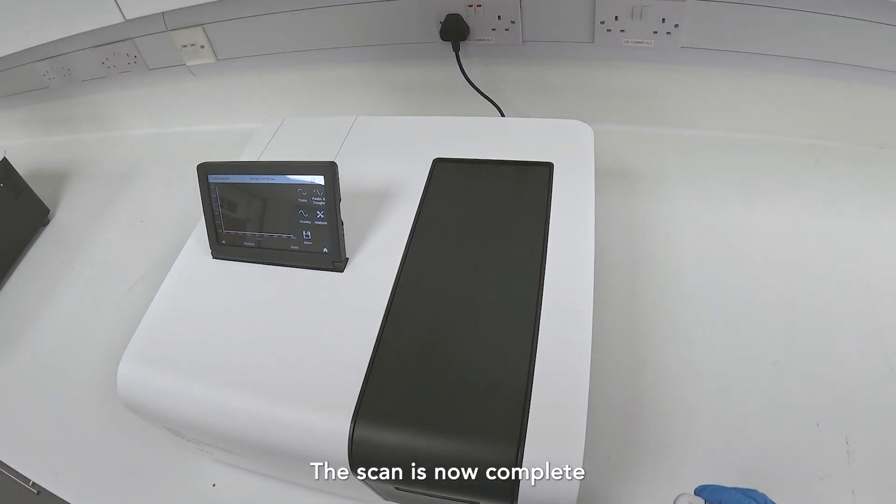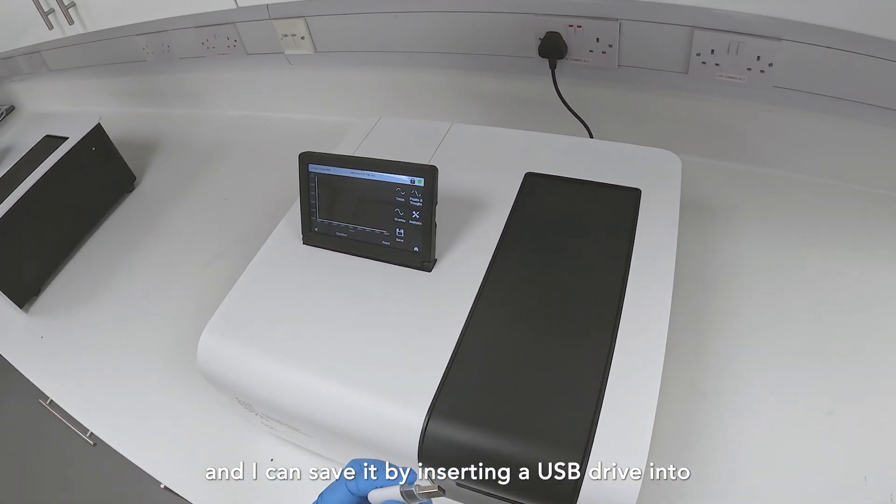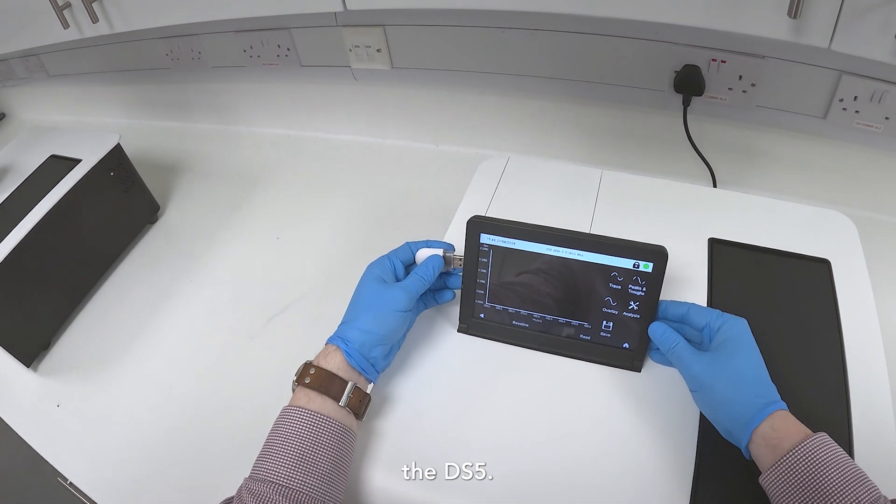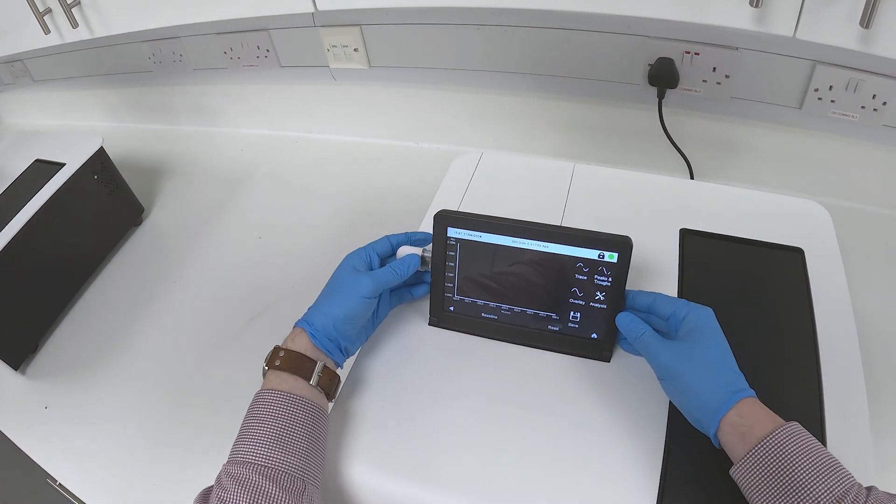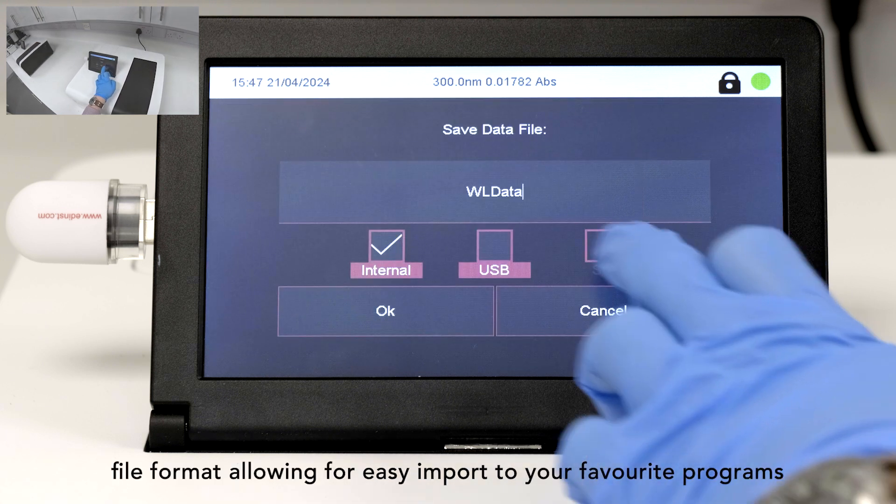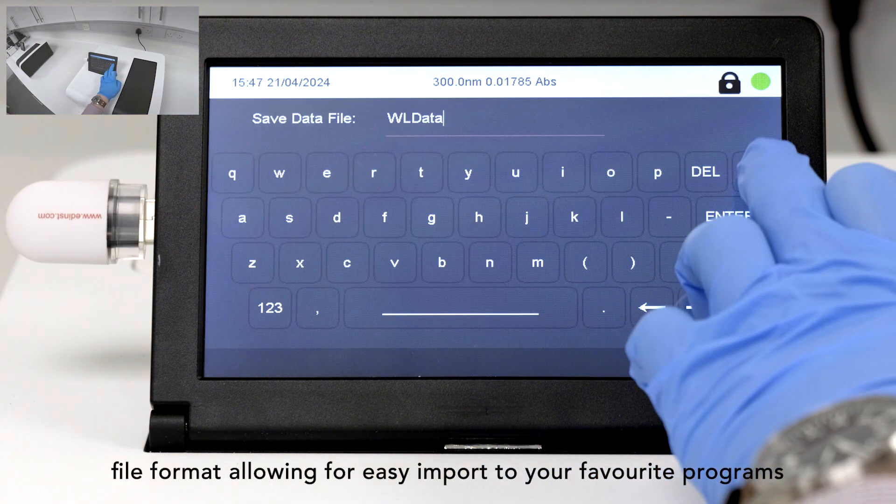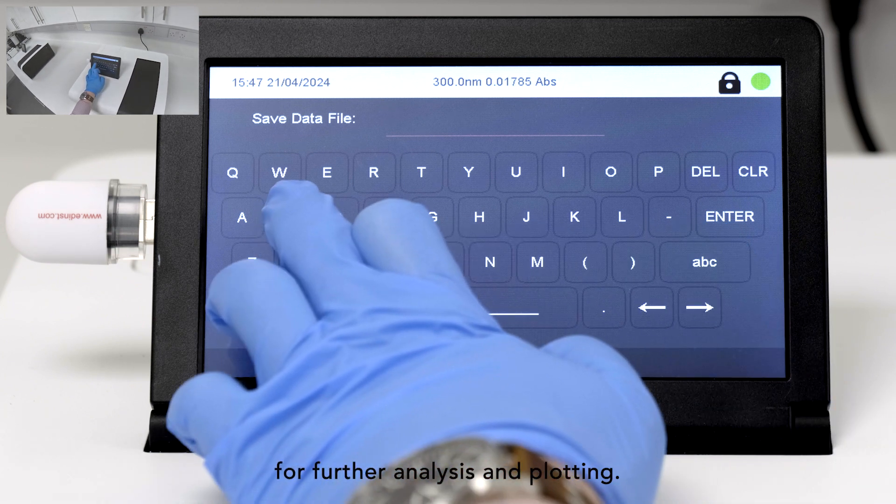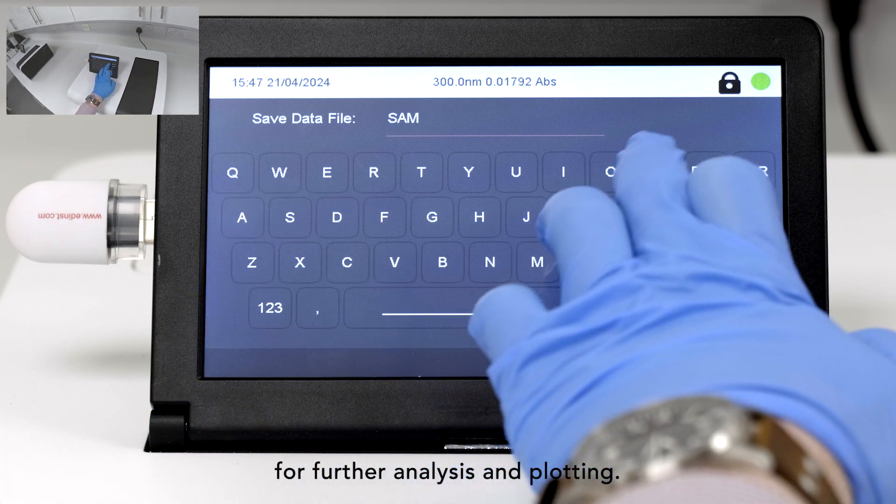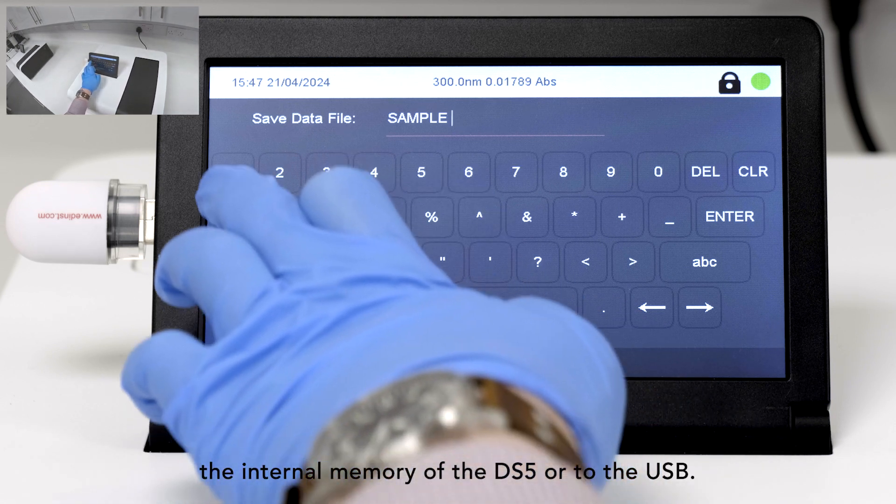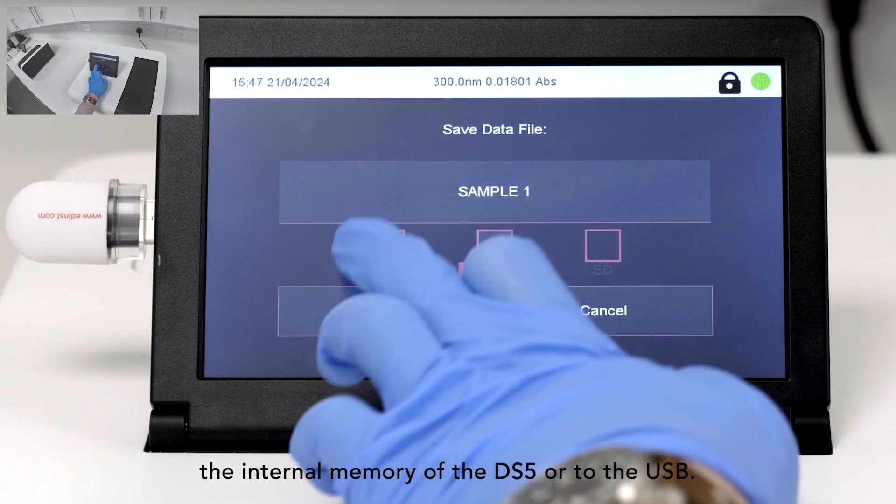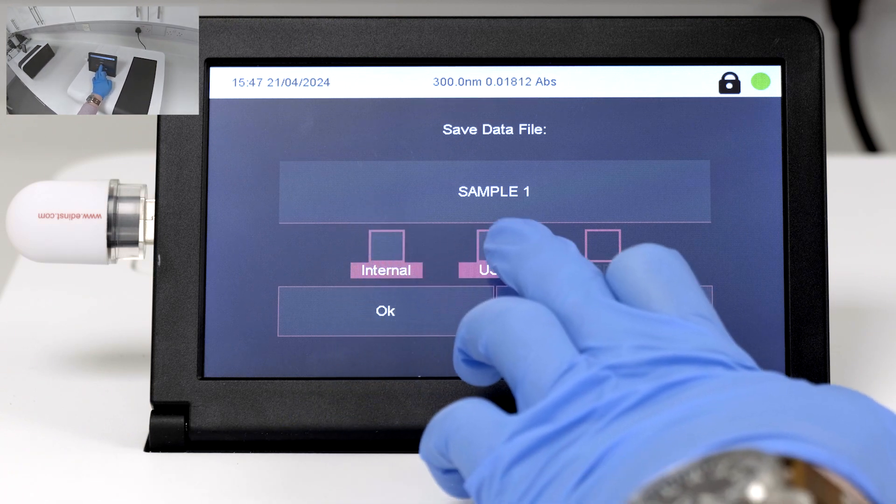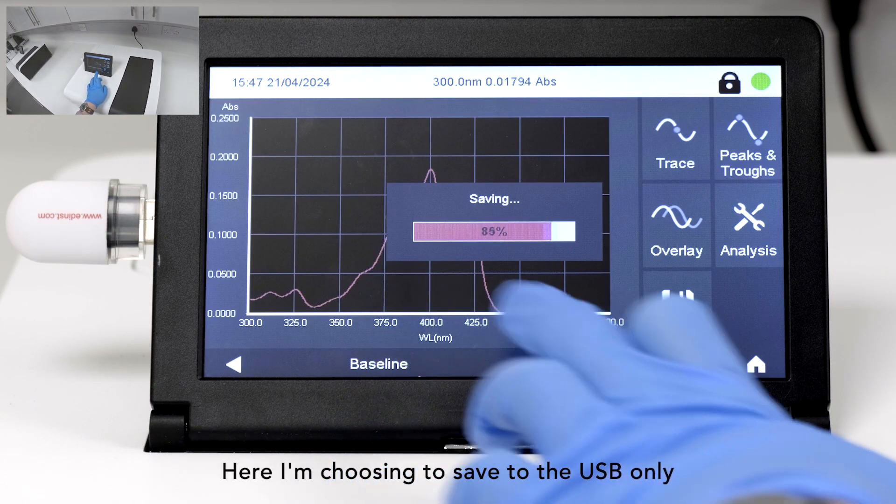The scan is now complete, and I can save it by inserting a USB drive into the DS5. The data is saved in an ASCII file format, allowing for easy import to your favorite program for further analysis and plotting. Files can be saved to either the internal memory of the DS5 or to the USB. Here I'm choosing to save to the USB only.